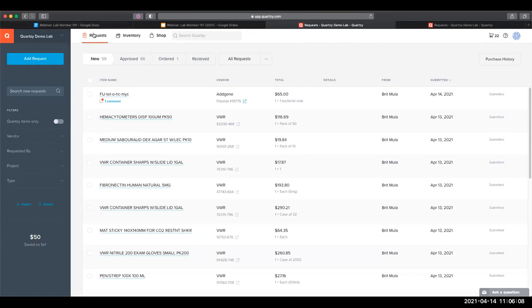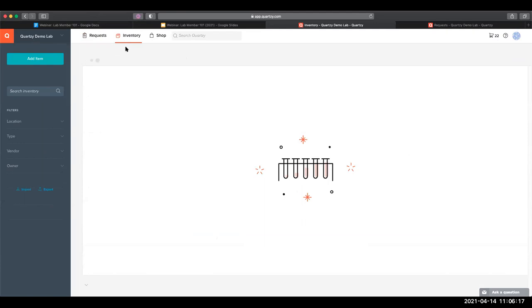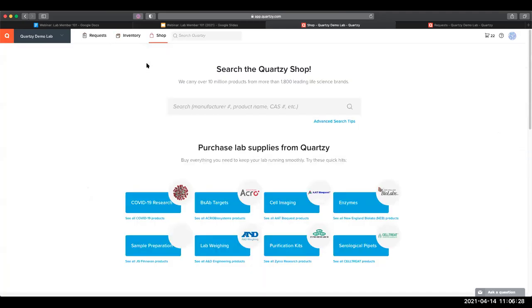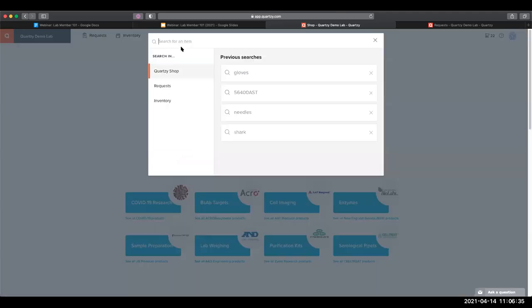On the left side of the toolbar is where your lab selection and module selections appear. If you're in more than one lab, you'll be able to click on this and select the lab you'd like to go to. There's a request module here, which is your lab's digital shopping list where requests and orders are tracked. Your inventory module is your lab's list of what's currently in stock, including where everything is located and all the important item data. We have the shop here, which is the easiest way to find and request items you'd want to order from Quartsy. And then lastly, we have our global search, where you can easily search across the shop, inventory, and your requests all at the same time.